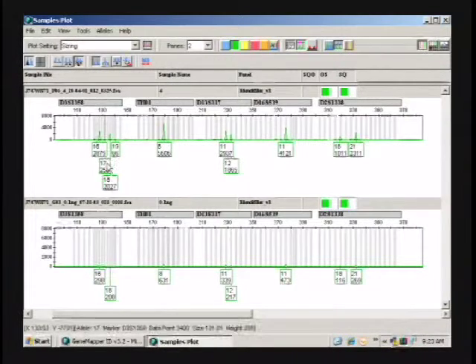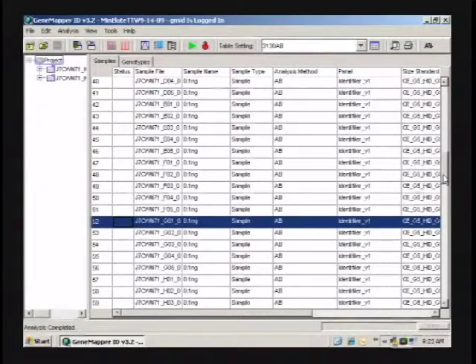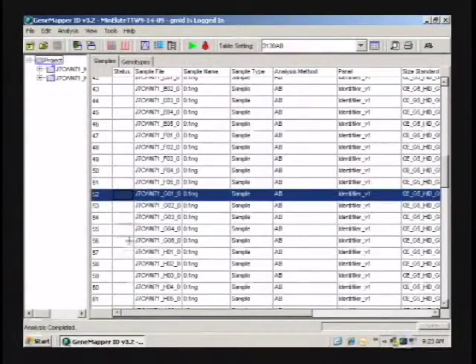About 298 went up to 2800. 600 went up to 5600. 473 went up to 4100. So it's almost a tenfold increase with that. Now let's look at number 5 and the beginning data for number 5. Number 5 would have been H1.